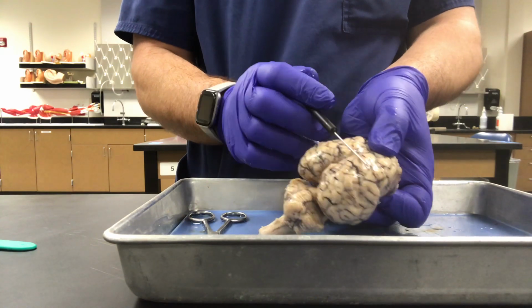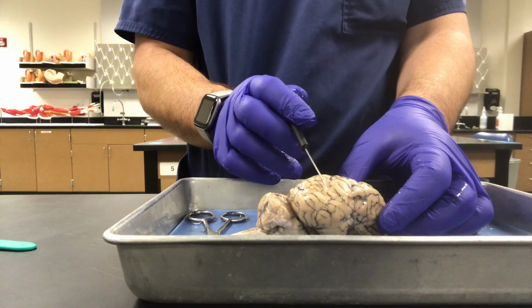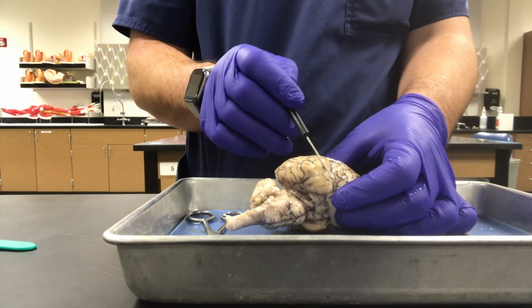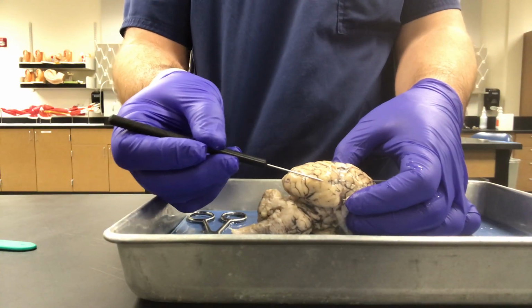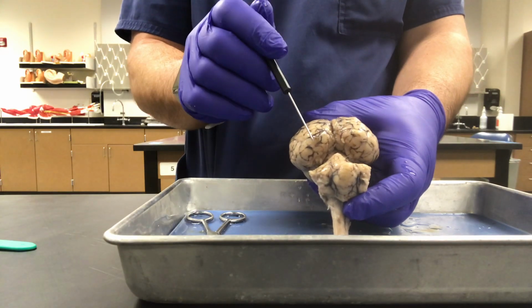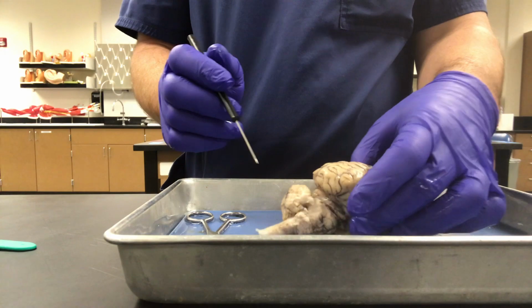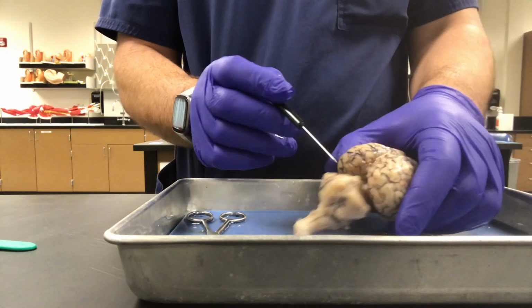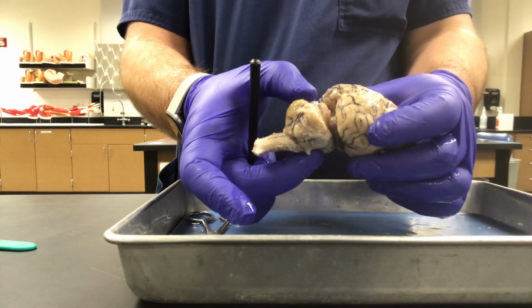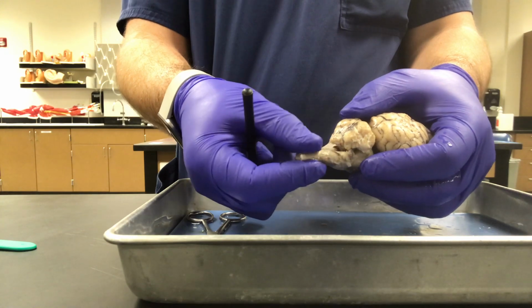Parietal lobes. So that's going to make up the top portion of the brain and over here as well. Then we have the temporal lobe, which is going to be this region right there. Next, you have the posterior aspect of the brain right there called the occipital lobe. Other lower structures you can see on the outside are going to be the cerebellum, which is this little mini brain hanging off the back of the brain right there. And below that, we have the spinal cord right here.